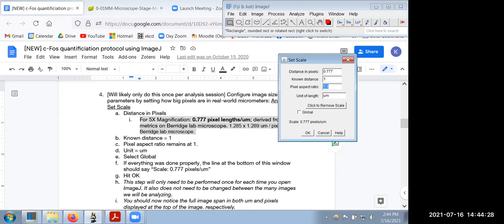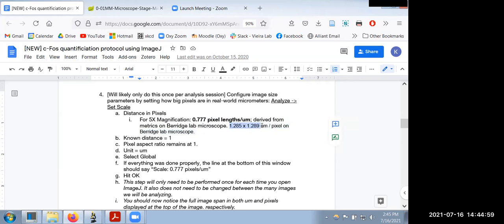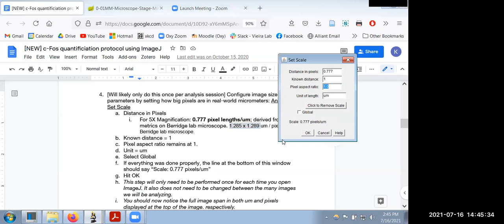Not all pixels — especially via certain microscope cameras — are perfect squares. For instance, the calibrations for my microscope told me it was 1.285 micrometers across but 1.289 micrometers vertical, so not a perfect square. It's close enough that I decided to keep the aspect ratio at 1, but if you want more precision you can figure out the aspect ratio difference. We're going to keep it at 1 and keep things simple.